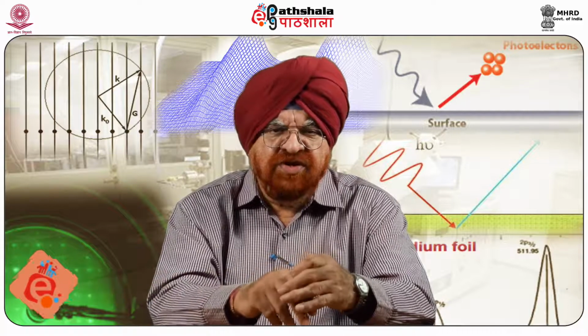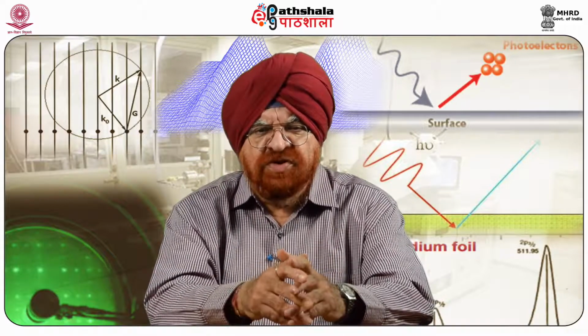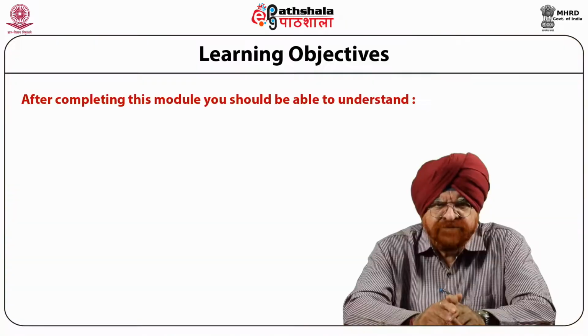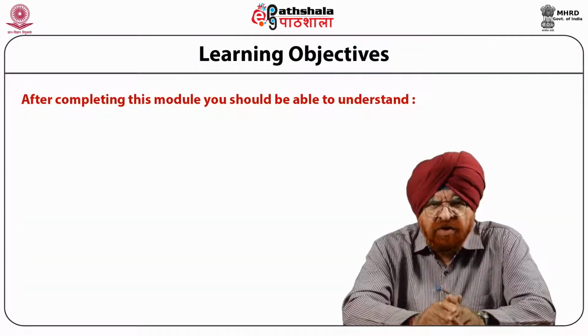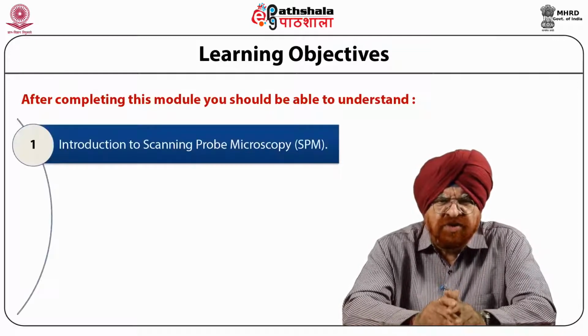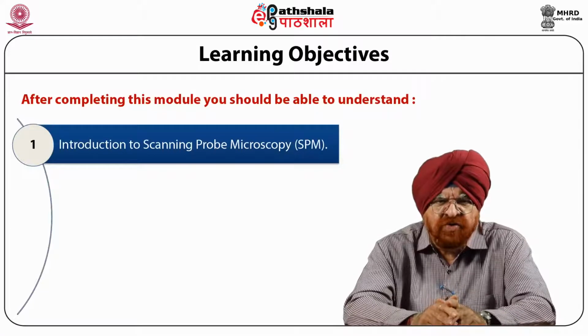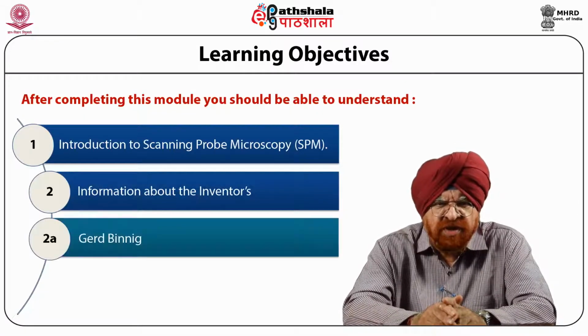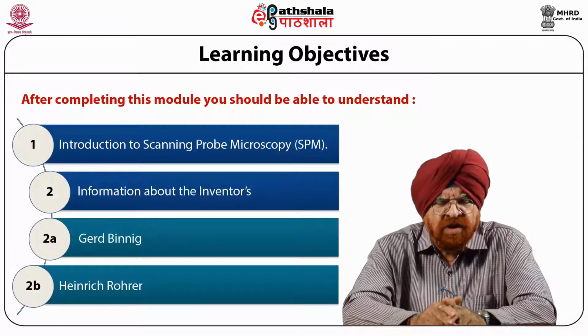Today, we are going to discuss the module Atomic Force Microscopy, as we call it. In this module, we'll deal with the introduction of this particular technique, which comes under the paper Surface Analytical Techniques Part 1. After completing this module, you should be able to understand the introduction to scanning probe microscopy, and information about the inventors, Gerd Binnig and Heinrich Rohrer.